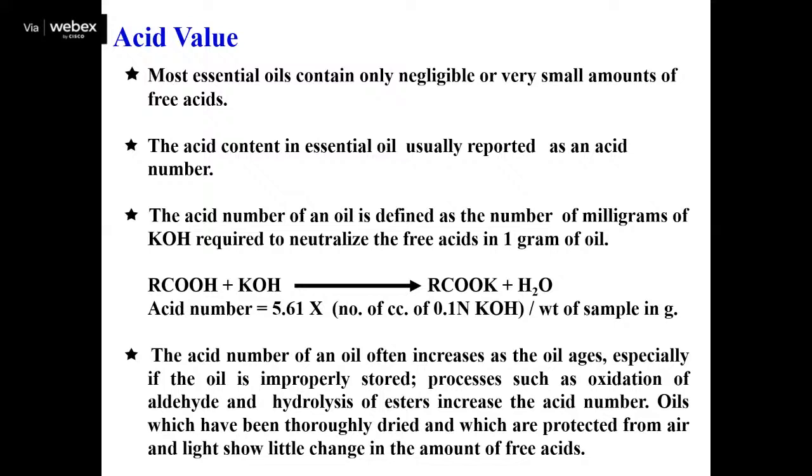But if the oil is exposed to moisture or gets oxidized or polymerized, then acid will form, and then some acid value will come. So acid value is also one of the criteria for other oils which have a carboxylic acid component, for which acid value matters. But for sandalwood there is no Indian standard. But if the sandalwood gets deteriorated, an acid value may come.